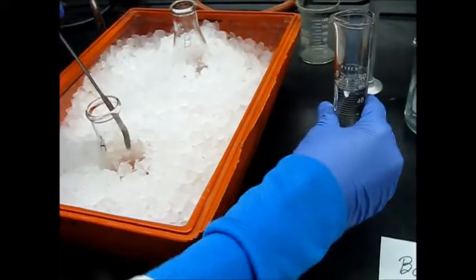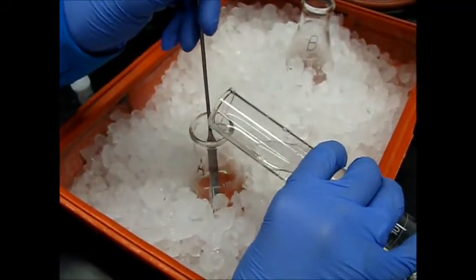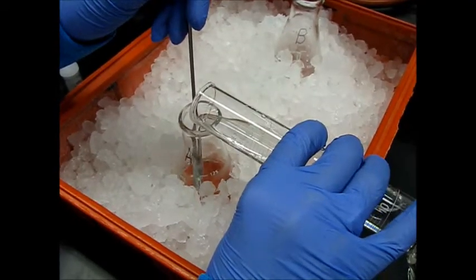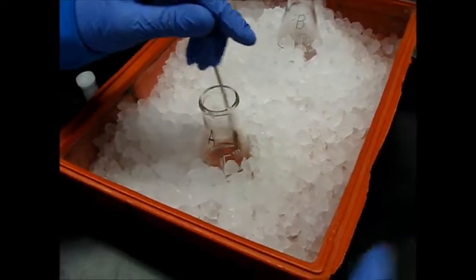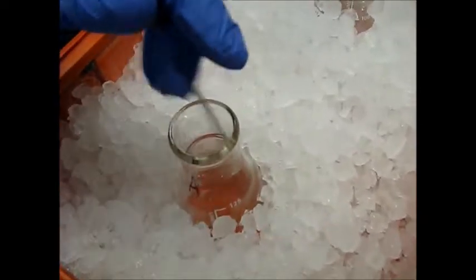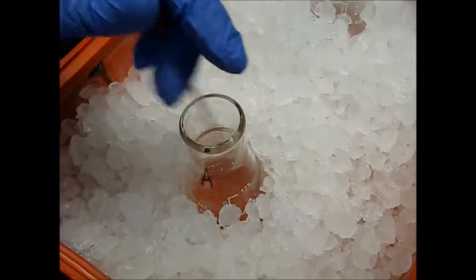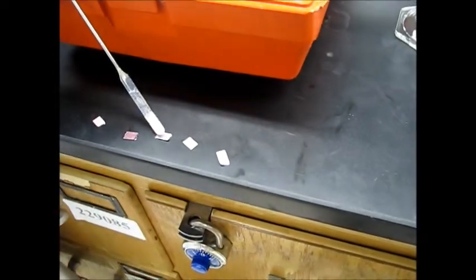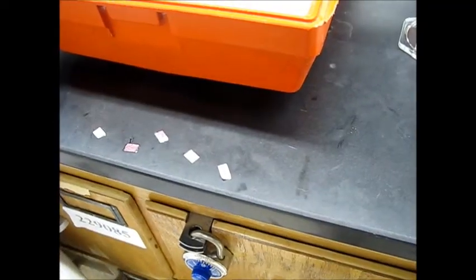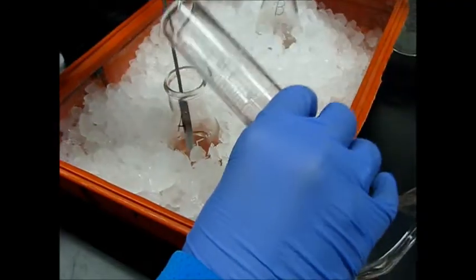So now we will start adding NaOH. I'll start by adding around 15 milliliters and stirring. We can then test the pH again using the litmus paper and it's still red we can see. So I will add another 15 milliliters.